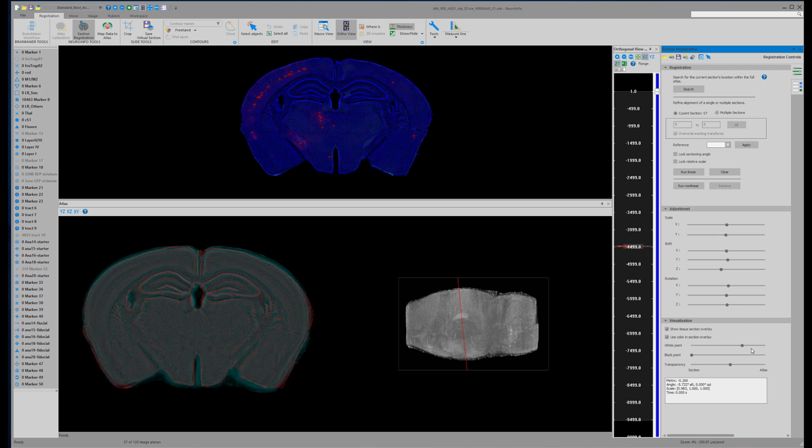And so you can see now that angulation that you're approaching, and that's the effect of not being able to cut in canonical coordinate systems, right? Right, exactly. Sometimes the right side of the brain in this case is a little bit caudal to the left side of the brain, and so not only can we rotate in this axis, but we can also rotate a little bit. You can see.